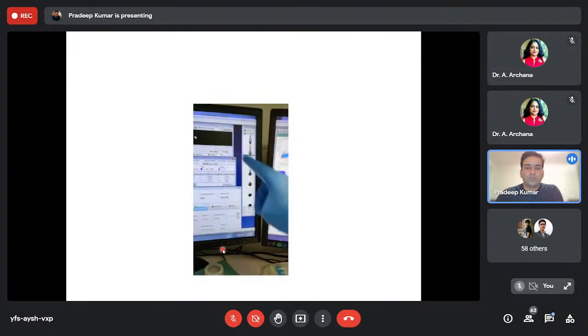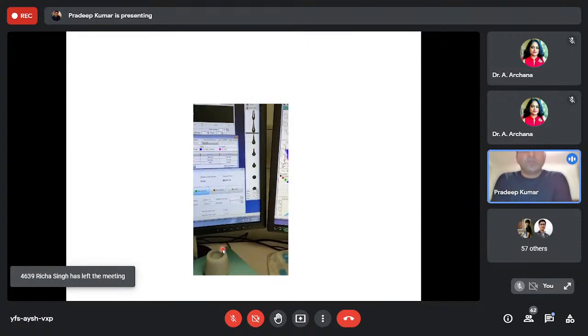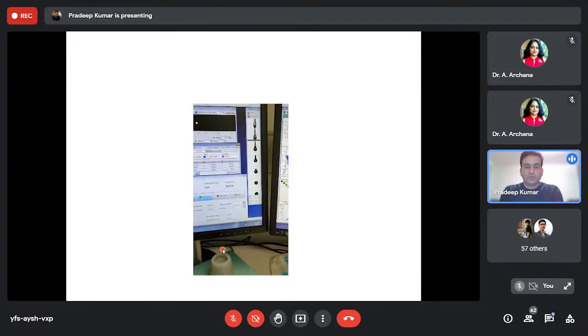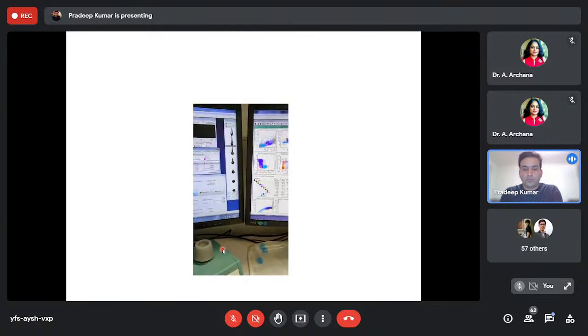Now the image that you are seeing over here is the image of the stream. Your cells are flowing through a continuous stream. The stream is basically of a buffer that's running through the instrument the moment you turn the instrument on. Your cells travel through the center of that fluid stream. The moment the cells are hit by the laser, interrogation happens and some light scattering happens. That light scattering is the signal that you are looking for.